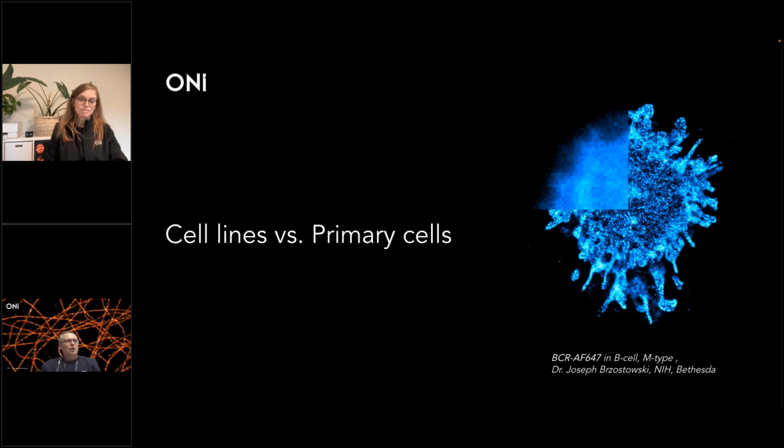If someone is familiar with immunology, when you isolate monocytes, they can be converted to dendritic cells or macrophages. But macrophages and dendritic cells grow on the surface. So these are ideal cells, because in the end they become adherent cells. If you grow them on a dish, on a glass bottom dish, you don't really need to do any manipulation to be able to image them by single molecule localization microscopy, at least in terms of adherence to the cell.